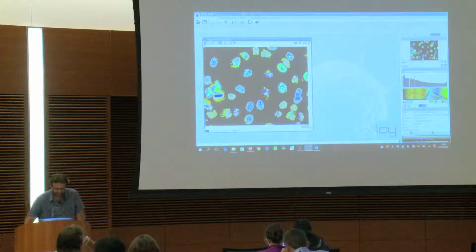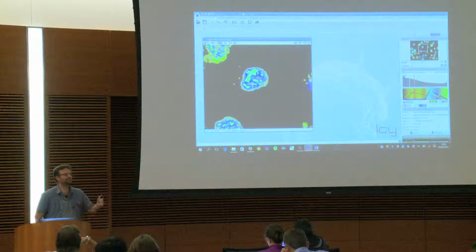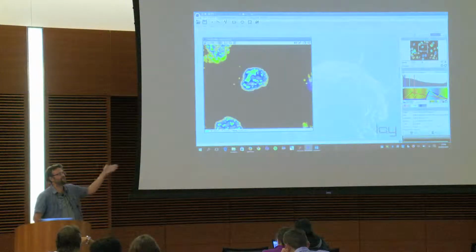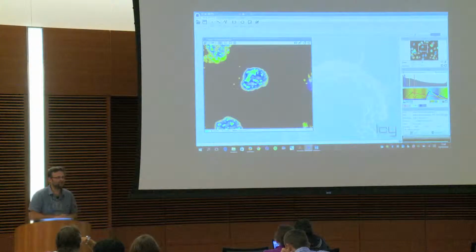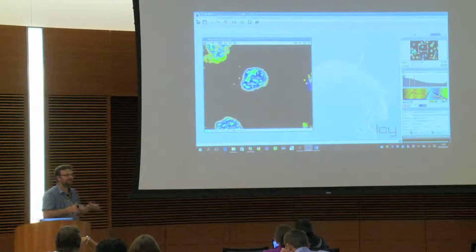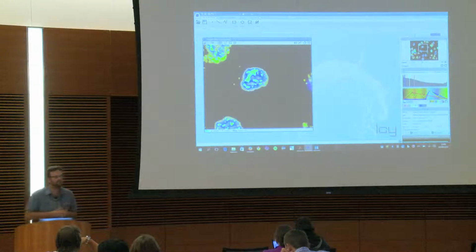And then I'm completely destroying my rendering, but it's very informative. You will see just after, I will show an application of why we need this tool, why we need the lookup table, because it may look strange. And by the end of this talk, you will also understand why we need the noise in the images, why it is so important.